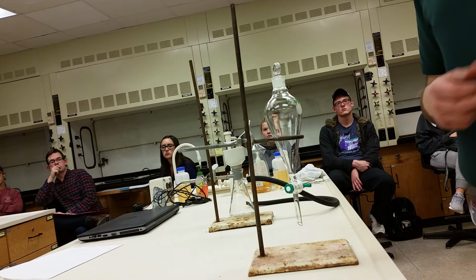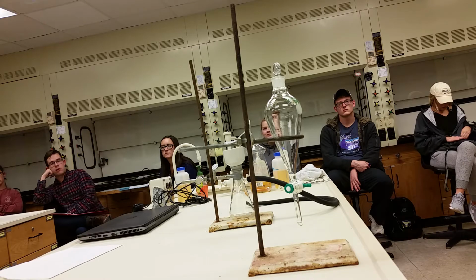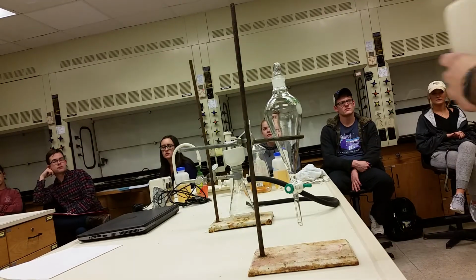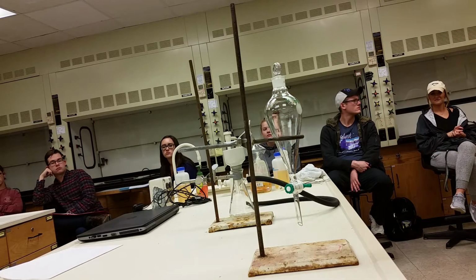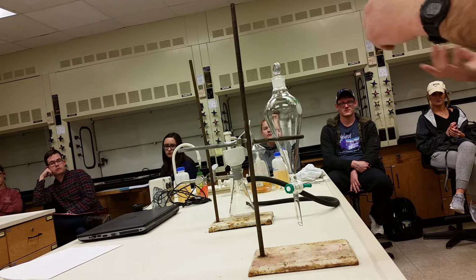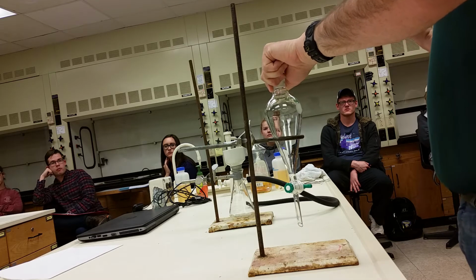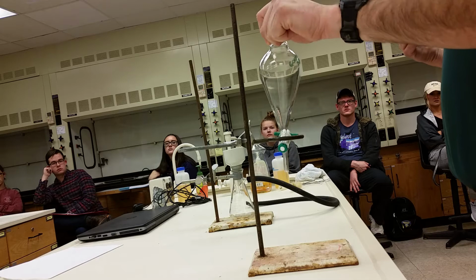Then you're going to come back over to the table and you're going to get 10 milliliters of 10% sodium bicarbonate. This stuff right here. Okay? You're then going to pour 10 mL into the separatory funnel. When you do that, you're going to start the acid-base process. The base is going to deprotonate the carboxylic acid and allow it to go into the water layer so you can separate them.